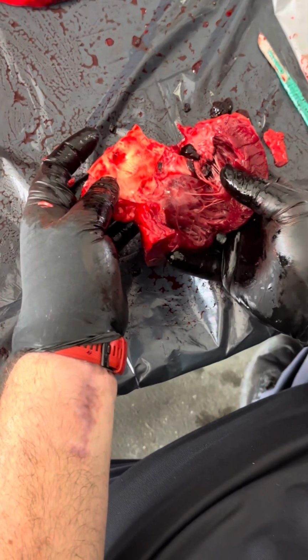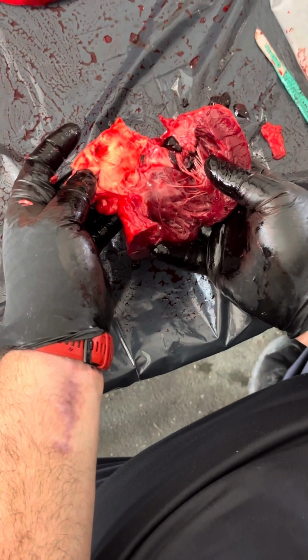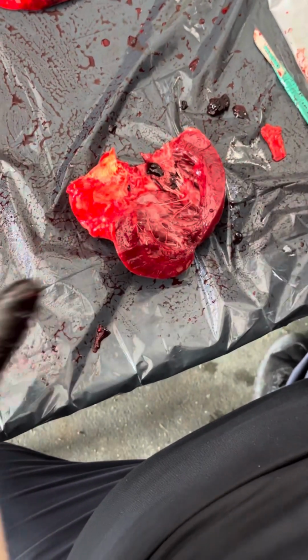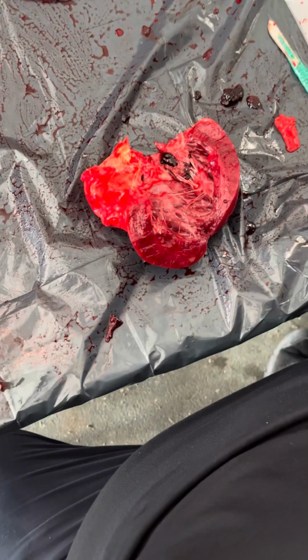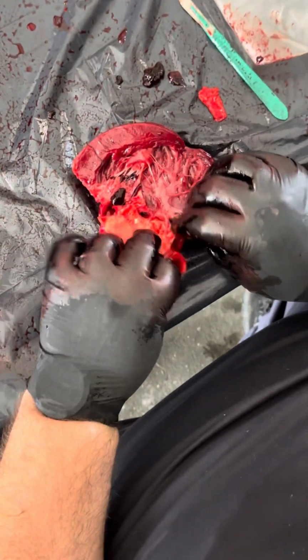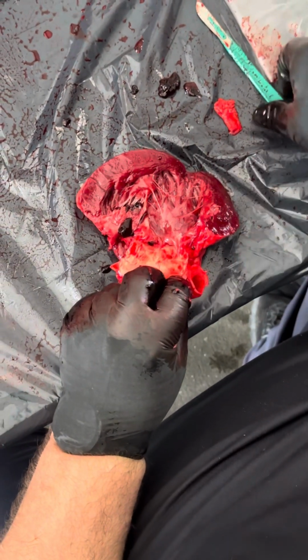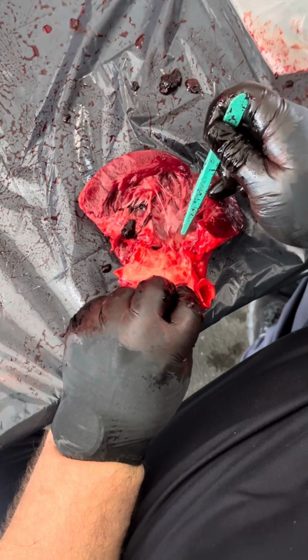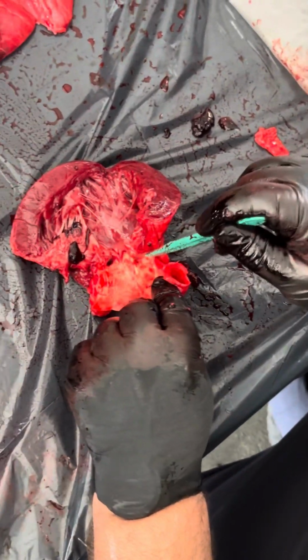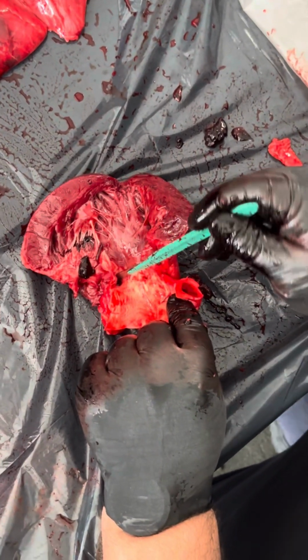So the pulmonary artery has a semilunar valve, and your aortic artery has a semilunar valve. As the heart squeezes, it forces those valves open. When it forces those valves open, it actually covers the left and right coronary artery. So the coronary arteries are right here. You can see the coronary artery. There's one, there's the other. That one's got a clot.